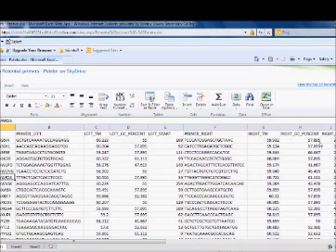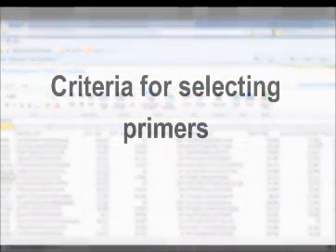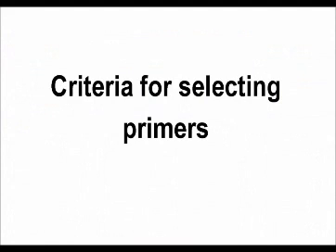So what you've seen is a list of potential microsatellite regions that could be really good for our DNA profiling. There may be hundreds. In our example, there were 151 different microsatellites to choose from. But not all of those will be any use to us, so we need to refine that list down to the microsatellites that will actually be useful in our profiling. To do that, we screen the potential microsatellites against a set of criteria to find out which ones will be useful and which ones won't. We'll eliminate them if they're not matching the criteria that we want.